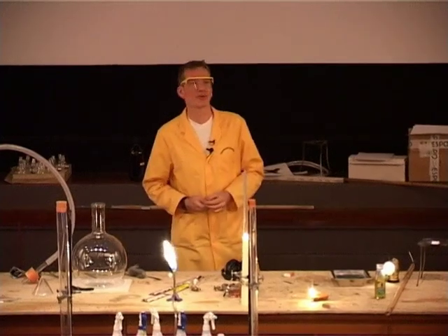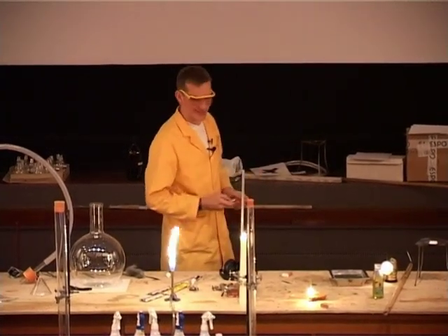This element is called, does anyone know what it is? Phosphorus. Oh, somebody's very good there, yes.